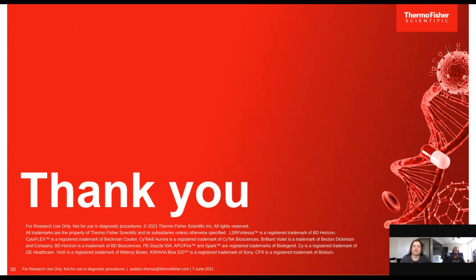One of the great things about the platform is we can test a number of things. So by the time we are looking at that, we are also comparing it to the Super Brights or the Brilliants. The other thing is that in some of these cases, if you are dealing with a really bright dye and don't have much separation, say with a transcription factor, ROR-gamma is a good example, where you just have a very small shift even when you have cells that are specific, sometimes you need that brightness.